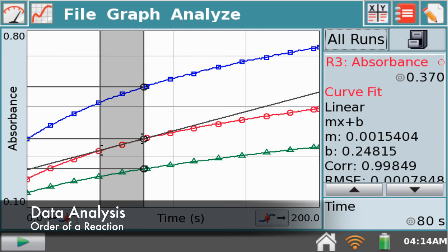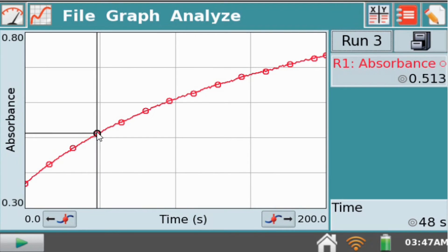Data analysis. After you have collected all three sets of data from the three trials, which is represented here by run 1, run 2, and run 3, you are ready for data analysis.